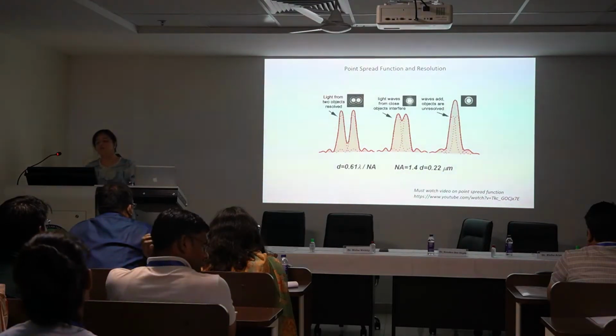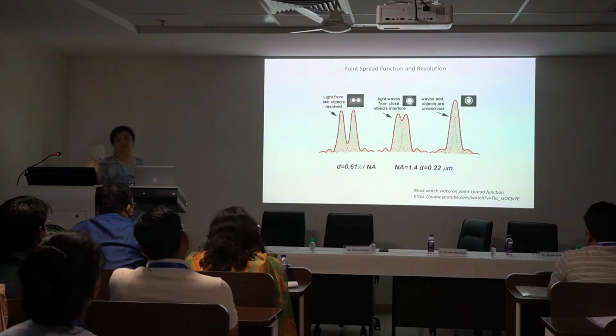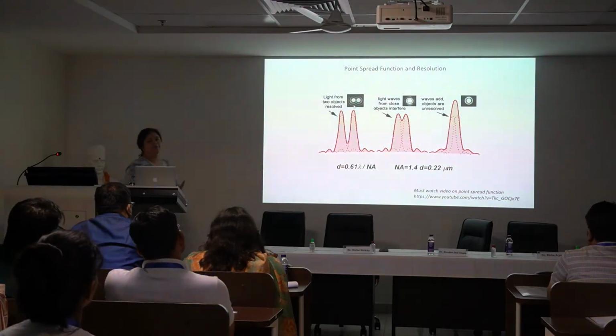And the goal for super resolution microscopes is to be able to resolve these peaks better. Okay, so let me just give an example of GFP, right? GFP is about 5 nanometers in size.